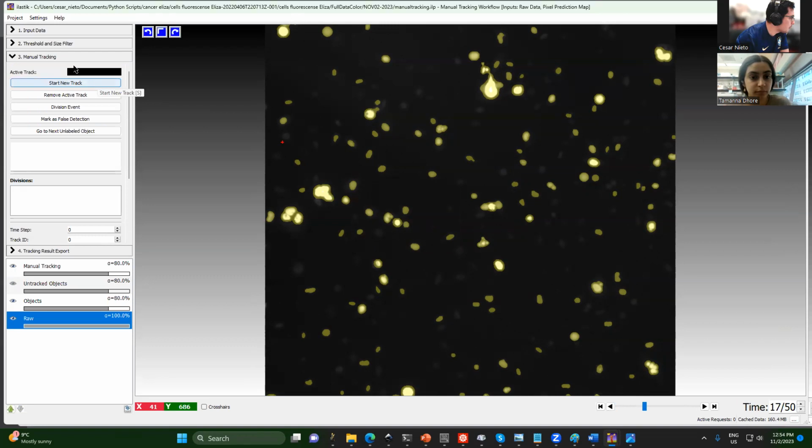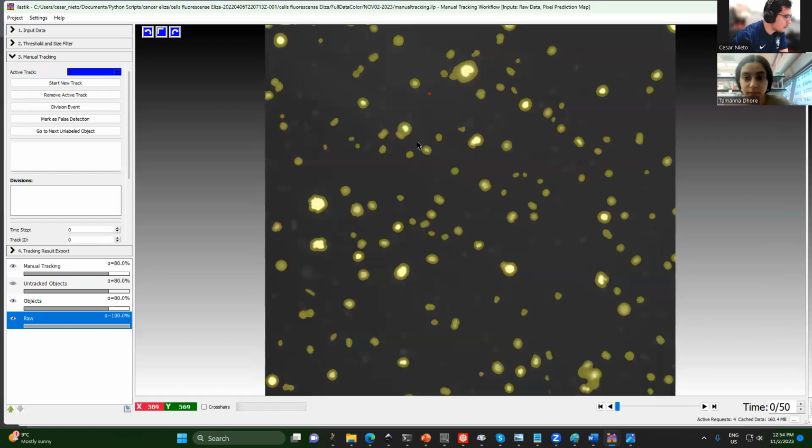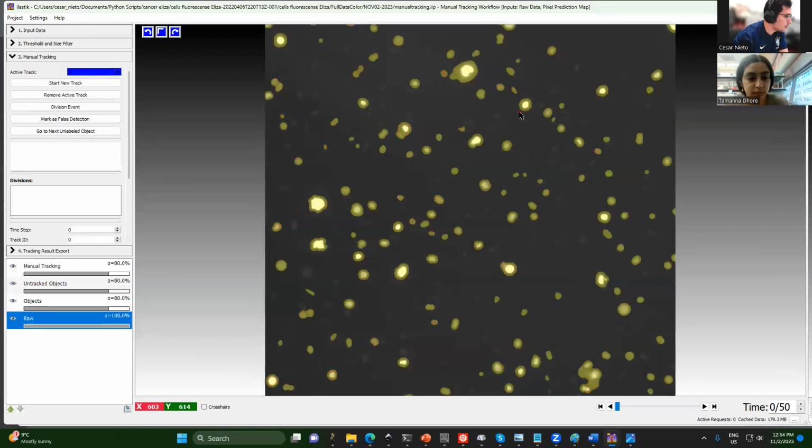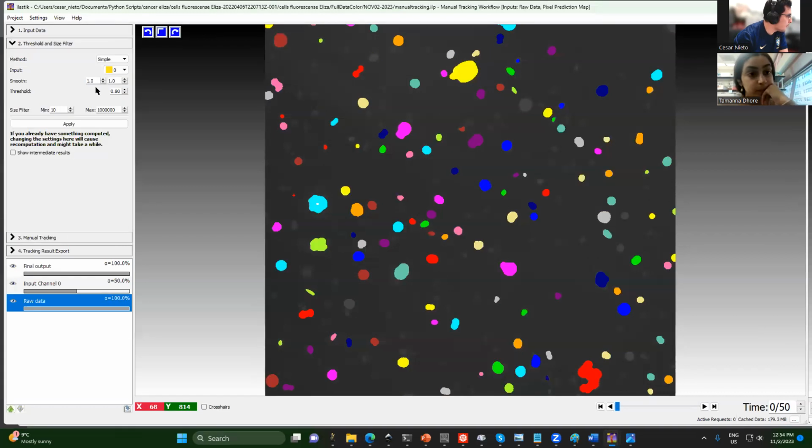Okay, so because I did everything again, I have to restart here with these parameters. So I have to do the tracking again. Zero. Right. Yeah.